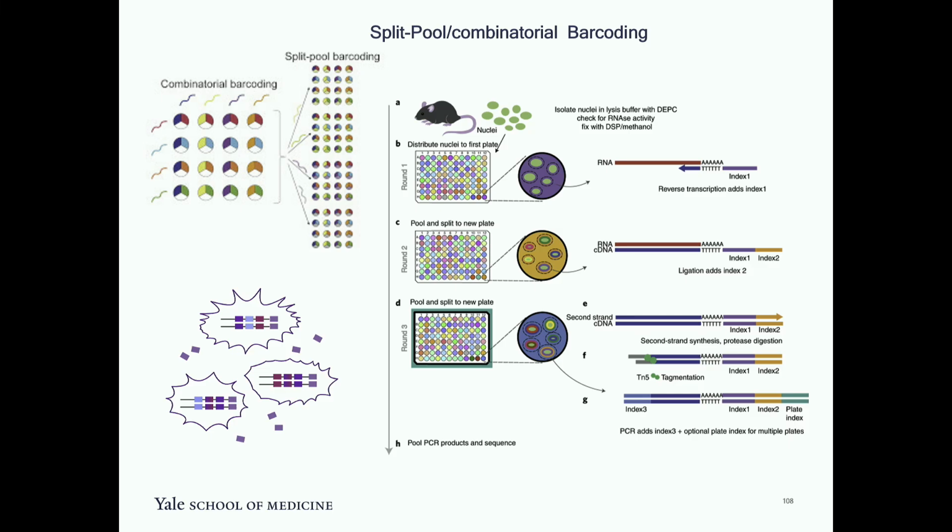It's simple. You take cells, put them into a mixture of things, and vortex it. They have a vortexer, and then you spin it down, and then they have some pipetting steps. That's it. It's very straightforward and it works well. I will send you a paper; there is a benchmarking paper. Our own benchmarking also shows that it's comparable with 10x data. It's very cheap, almost 4 times cheaper.